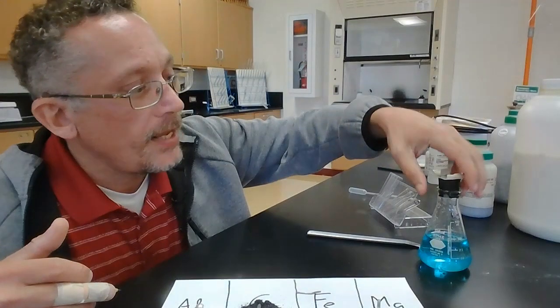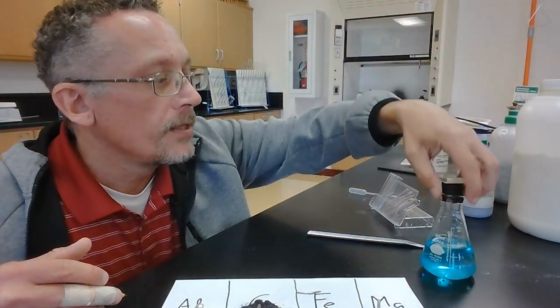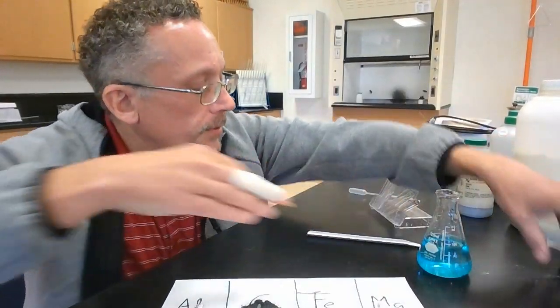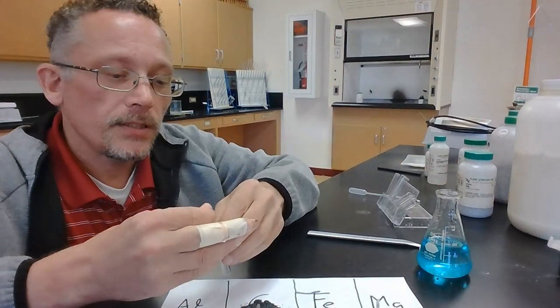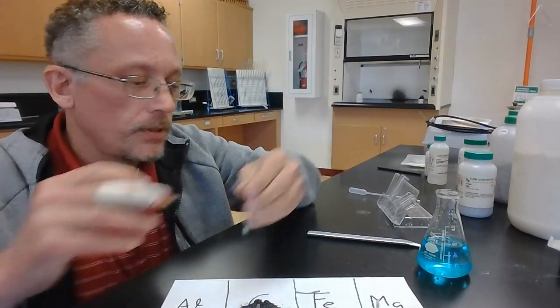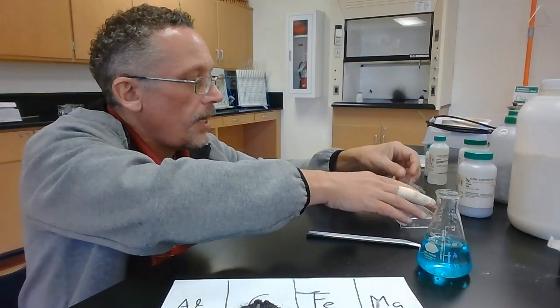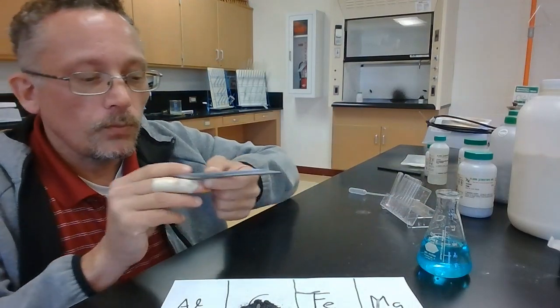Okay, so the last part of our lab here, it wants us to see which of our elements is going to react with copper(II) chloride. And here I have this nice pretty blue stuff. This is copper(II) chloride. So what I'm going to do is take the top stopper off of that. I'm going to put some of each of our elements into a test tube, and then we'll put some copper(II) chloride in there and we'll see what reacts.